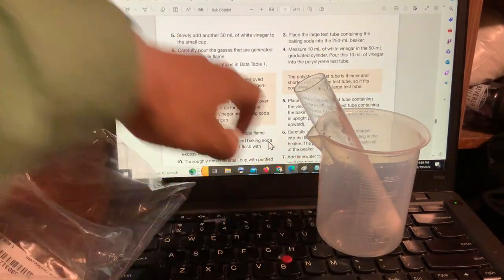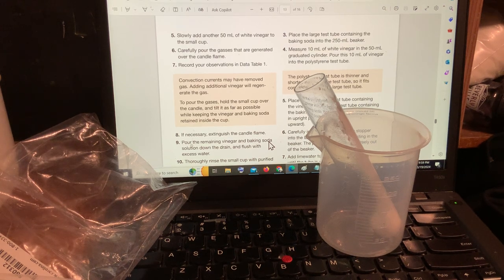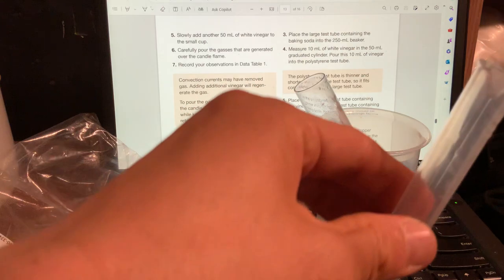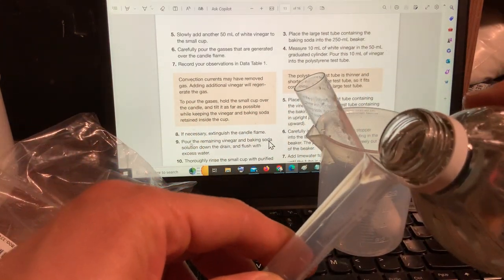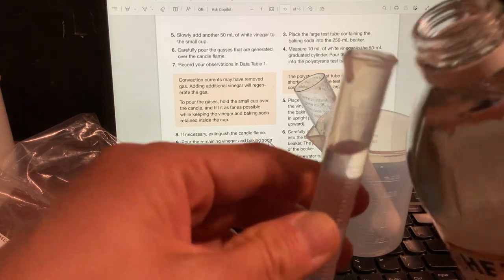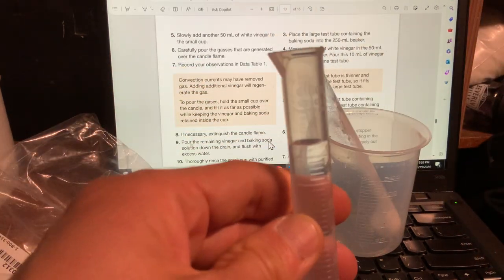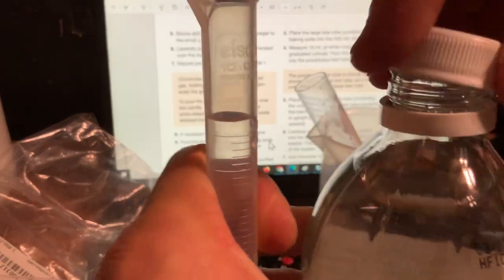Okay, we don't need this candle here. Now I'm going to add 10 milliliters of the vinegar. It doesn't have to be exactly 10 milliliters, but about 10 milliliters, right? You see I have a little bit more than 10 milliliters? I'm not concerned because this is qualitative, not quantitative.